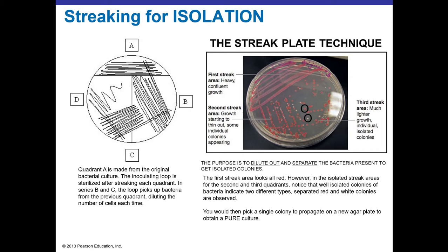And then literally it's like scribbling on the agar, but pulling down and not going back over the previous lines to make quadrant B. We're then going to flame, do that again for quadrant C, and my quadrant D, as seen here, oftentimes usually ends up just being a little squiggle, but it's still a 4-quadrant streak.